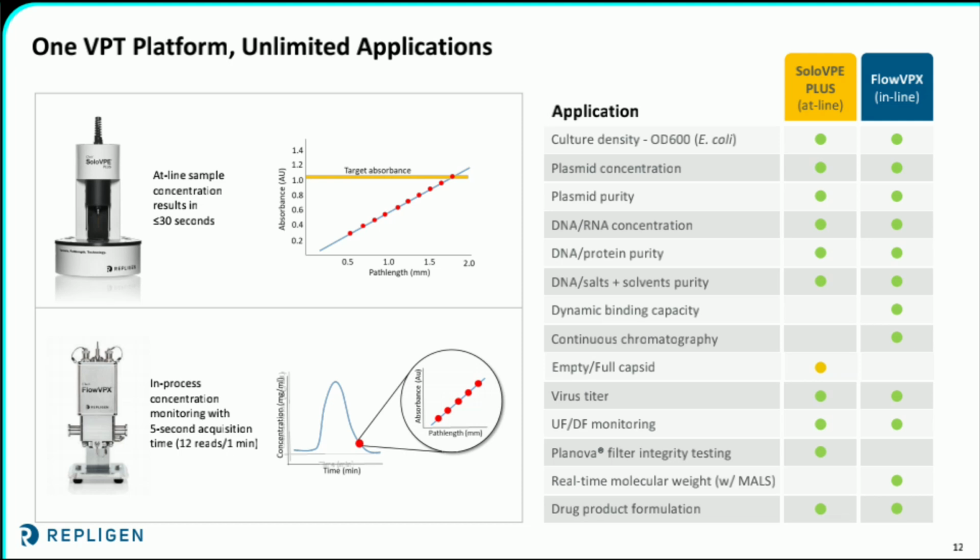I'm sure while you were listening to the presentation, you saw a graph in the top right corner. That's the graph projected from the KR2i RPM system onto the PowerPoint, so you can see the concentration in real time. We started at 25 mg per mil, and we're currently at 32 mg per mil. However, we just hit our TMP, so we should be speeding up soon. So I'll hopefully let James cover the poll questions now if everyone's ready.